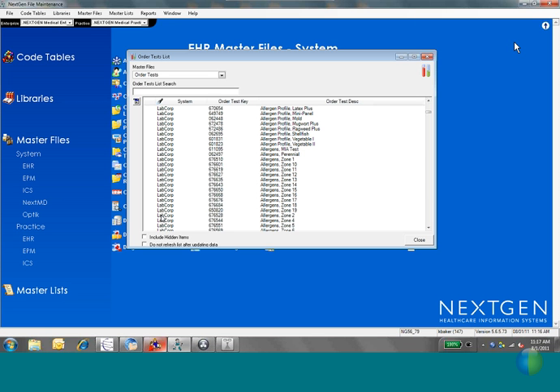Those are their individual test codes that they use to place orders. And if it's radiology, then it's going to be CPT codes for those particular items. But what's basically going to happen is the vendors that you're interfaced with will provide you a spreadsheet with all of their codes. And if you have more than one vendor, you will need to have more than one spreadsheet. So you'll need your LabCorp codes, for example, and your Quest codes.